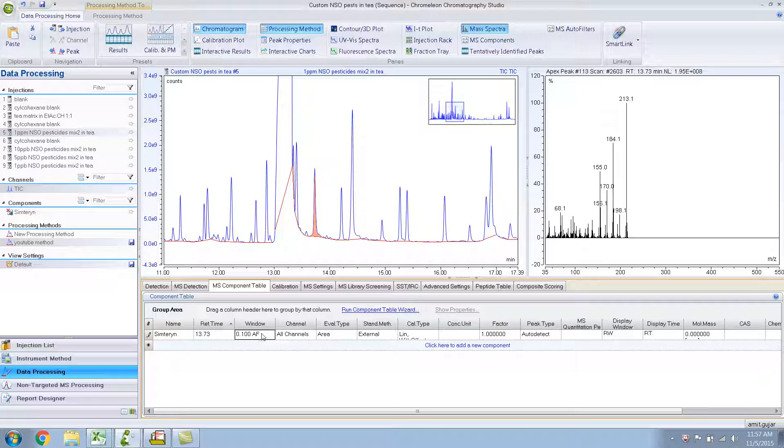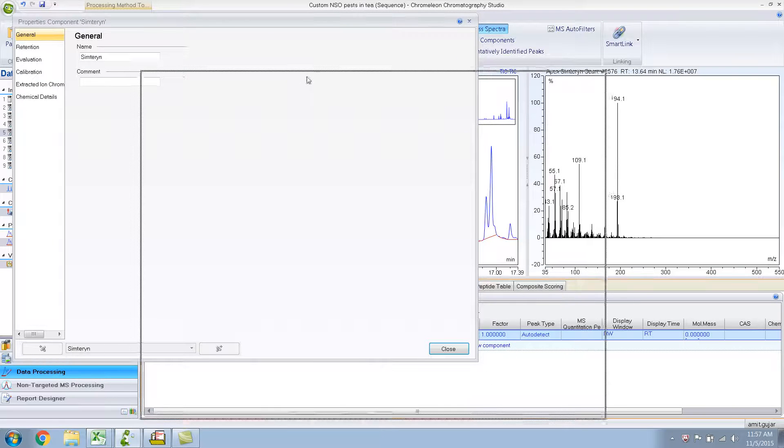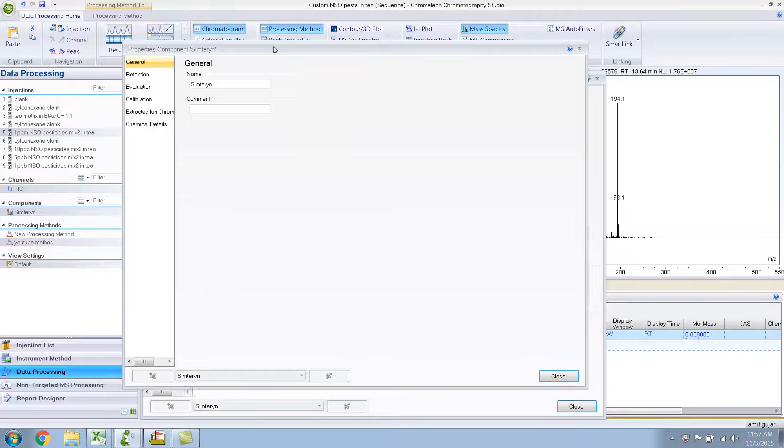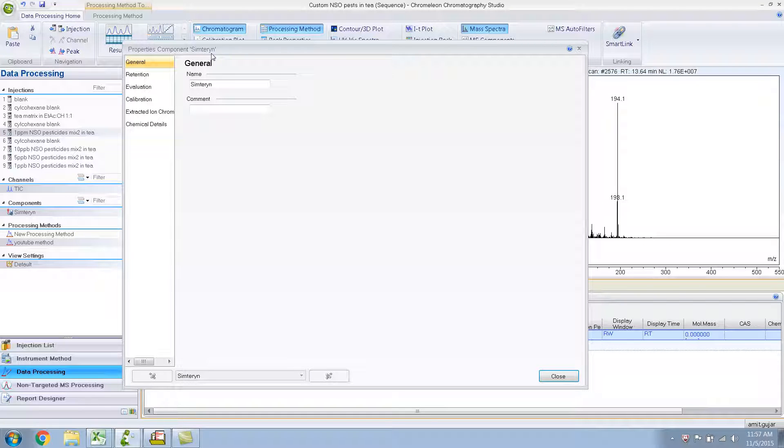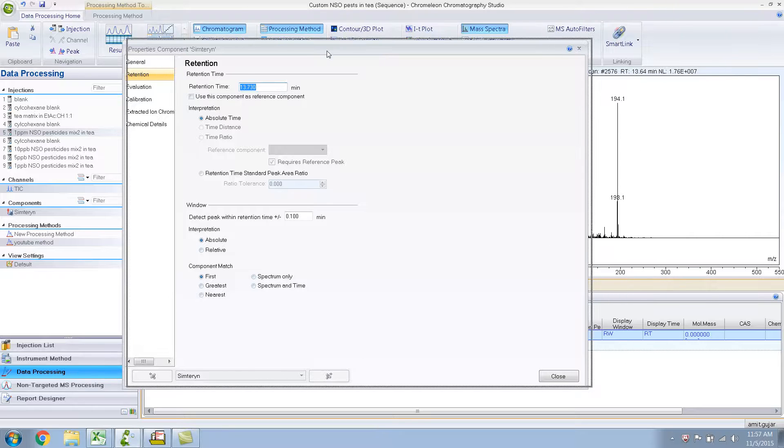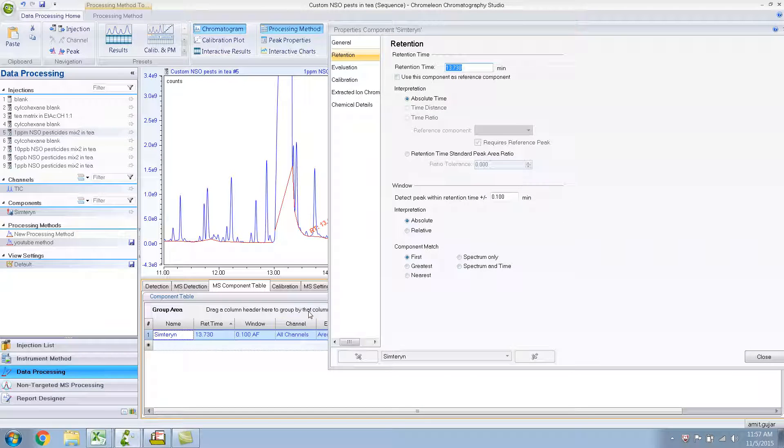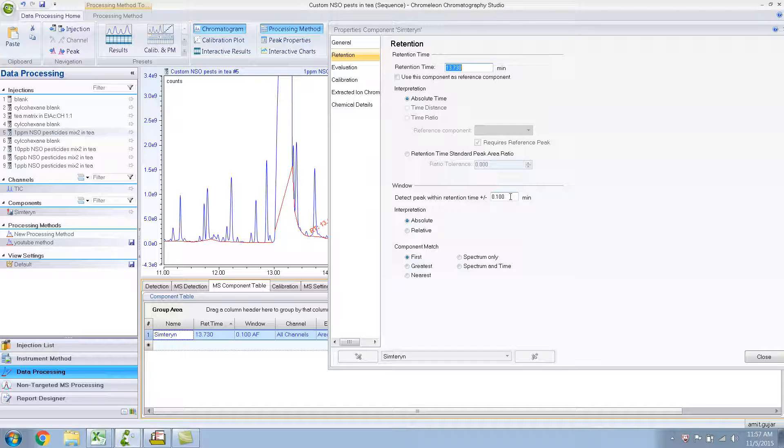And the window. The window is 0.1 AF. What is AF? Let me show you more details about this. If I double click on this, it will open up a window which shows the properties for this Simteryn compound that we have just now created. Retention, we wrote that down, 13.73. This 0.1 that you saw over here, the window, it will try to detect the peak at 13.73 plus or minus 0.1 minutes. And then interpretation is absolute, and the component matches first.